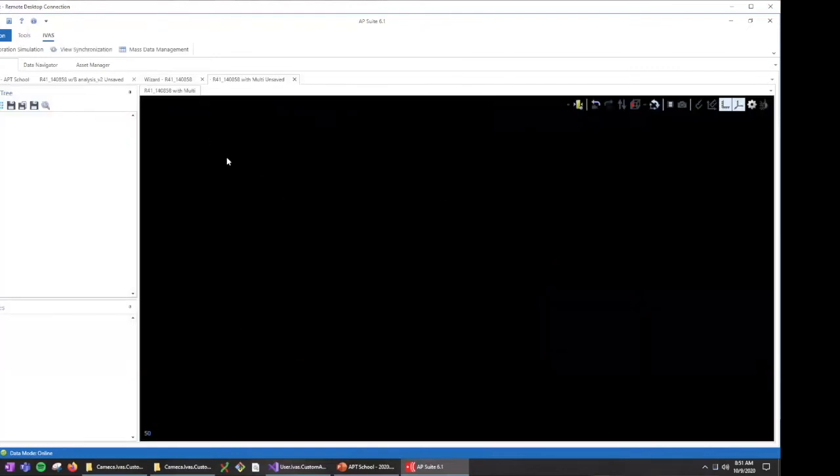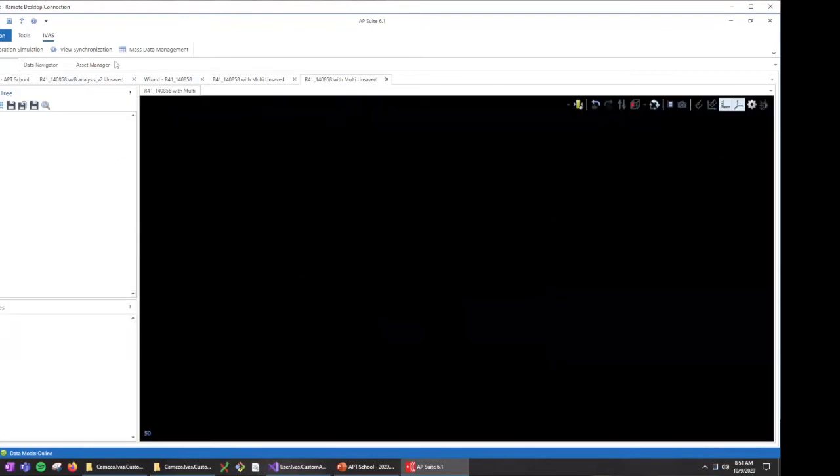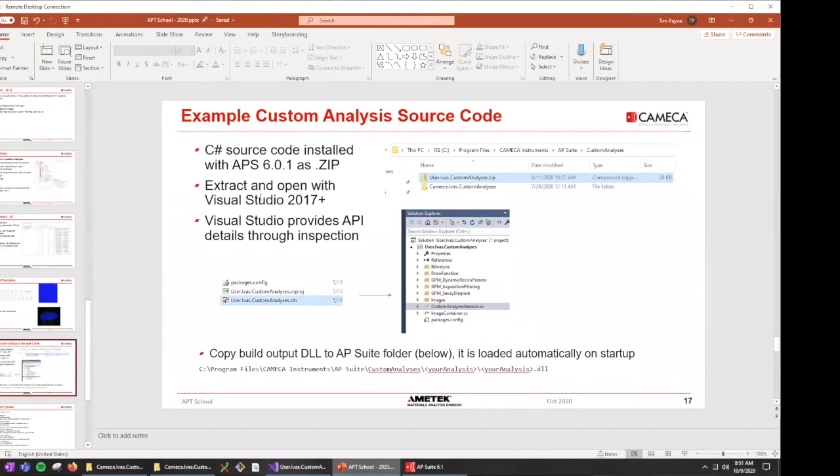Oh no. I'm running a brand new debug version, so I may be in a bad spot here where I don't have the right things. Well, we'll come back to this later. So let me continue here with the presentation.